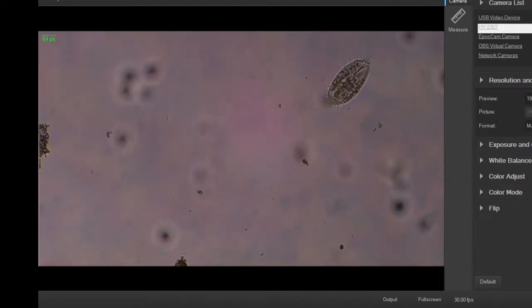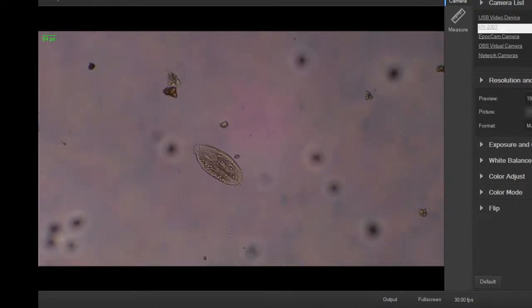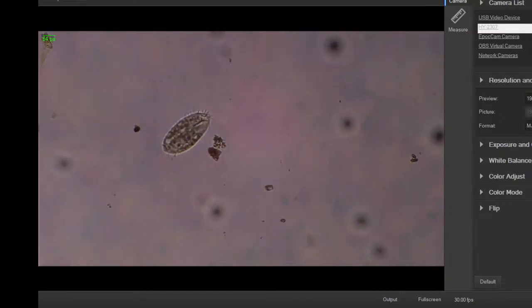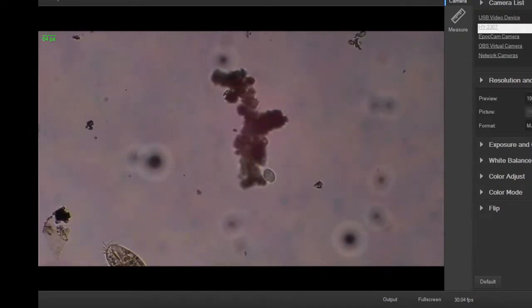So it tends to swim in that direction, but it does occasionally back up. So those are cirri. They're fused cilia that make them pretty thick. So very easy to see on camera, on a microscope. And there's that little guy next to that in that cluster. That's kind of cool. You can see that little guy swimming around the debris as well.